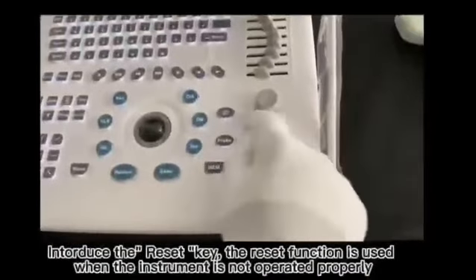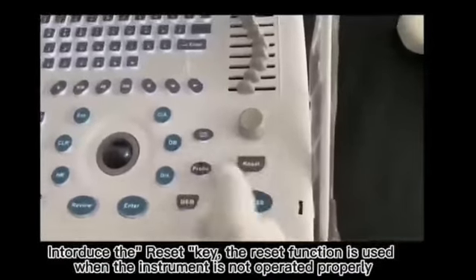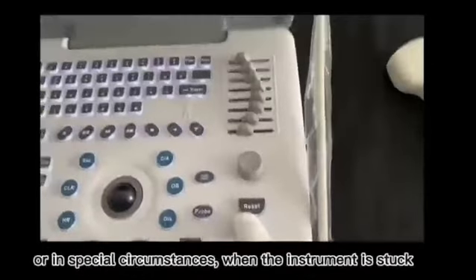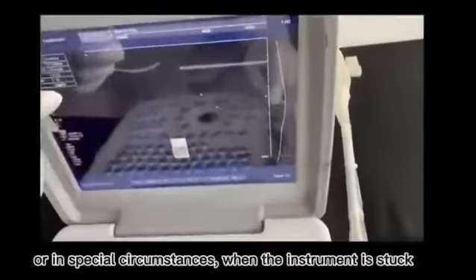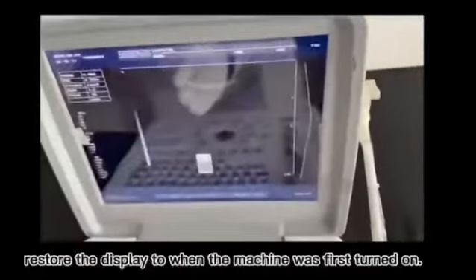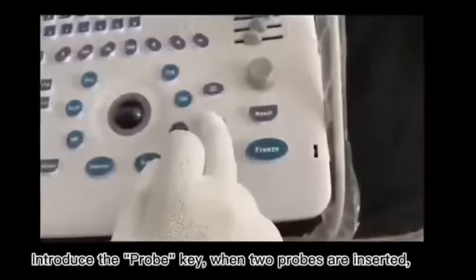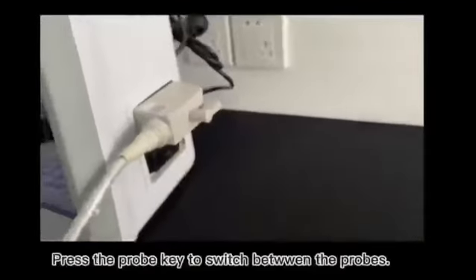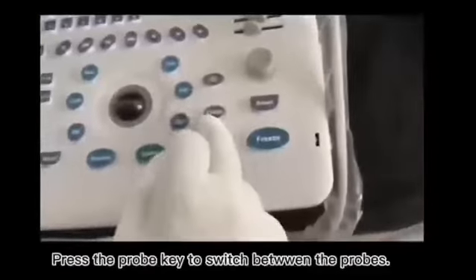Introduce the reset key. The reset function is used when the instrument is not operated properly, or in special circumstances, when the instrument is stuck. It restores the display to when the machine was first turned on. Introduce the probe key. When two probes are inserted, press the probe key to switch between the probes.